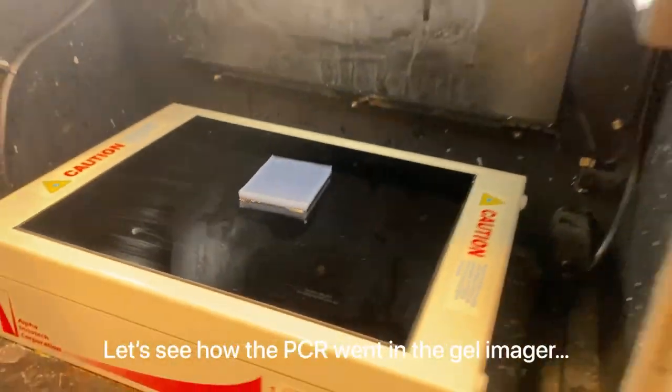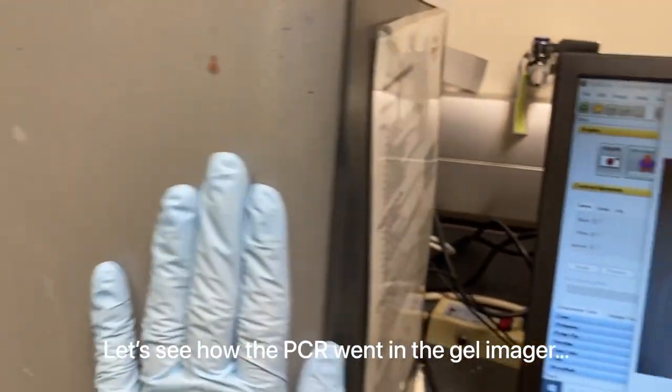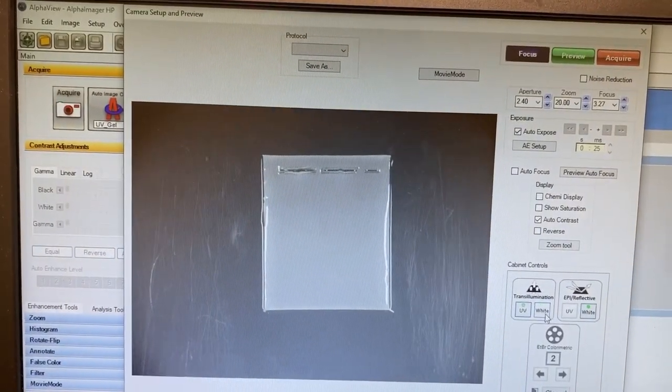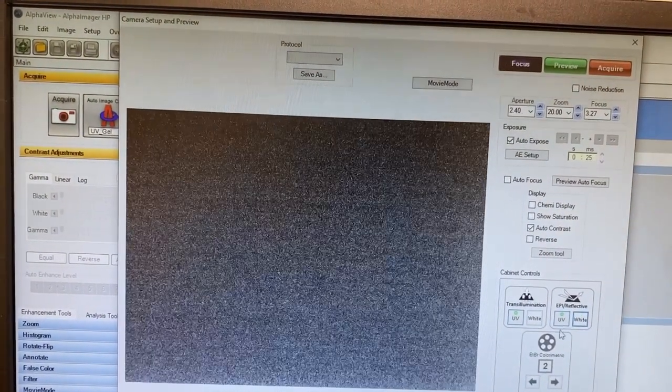I'm putting my gel here into this UV imager and now let's turn on the UV light. We've seen those bands — I like what I see.